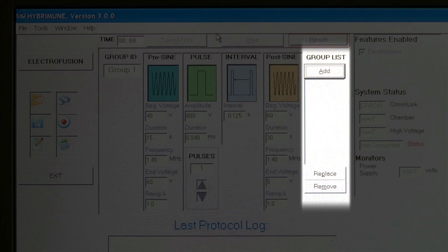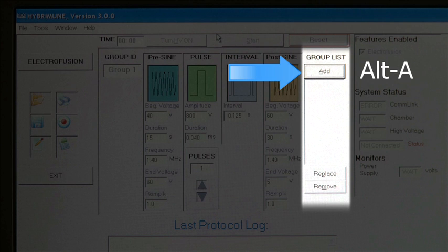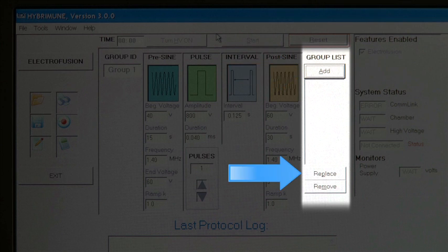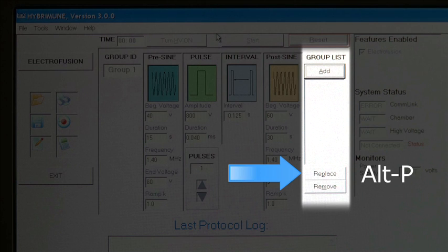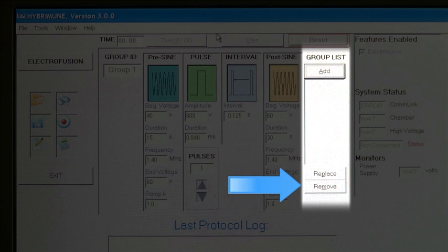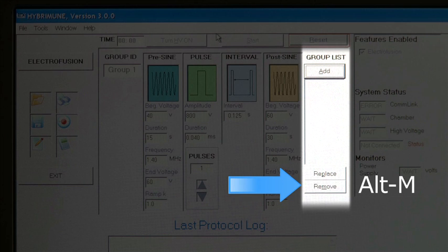There are three buttons to control the group list. Add (or Alt+A) is used to add a group to the list. Replace (or Alt+P) is used to change data within a group; changes made to values will not take effect until Replace has been selected. If a pulse parameter is changed but not replaced, an error dialog box will appear if the user tries to run the protocol, and the user will be prompted to replace the values first. Remove (or Alt+M) deletes a group; if a group is deleted, the group numbers below the deleted group are renumbered accordingly.